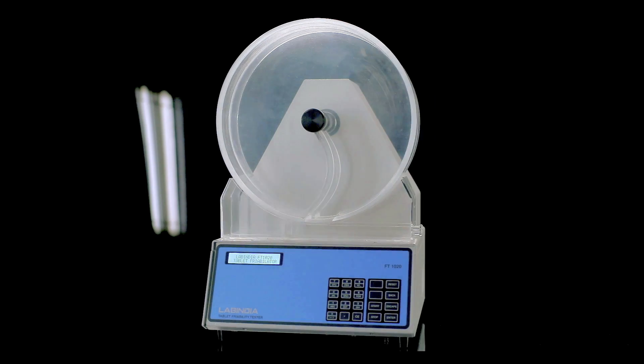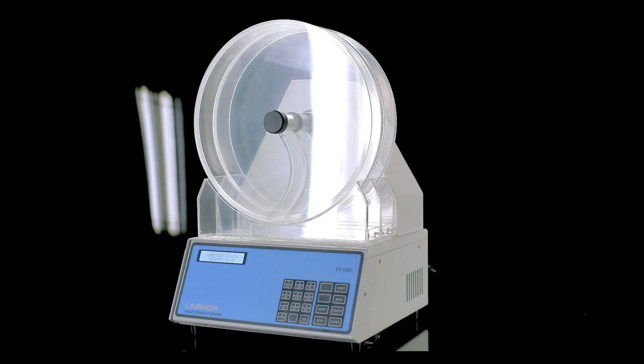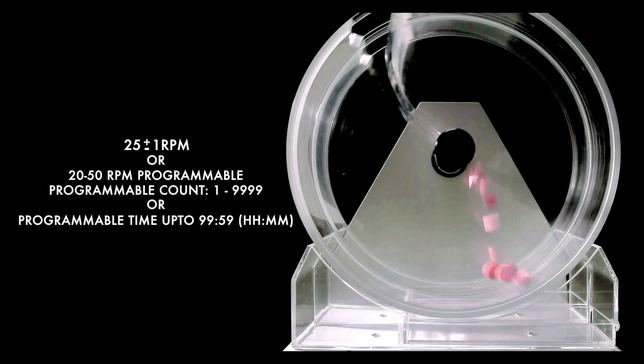And kudos to our friability testers in their labs that empower them to accurately determine the durability of the tablets with consistency and ease.